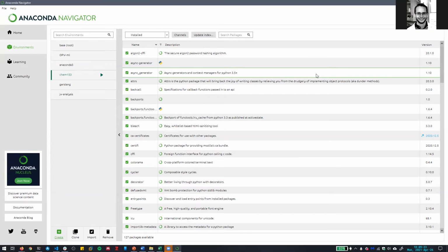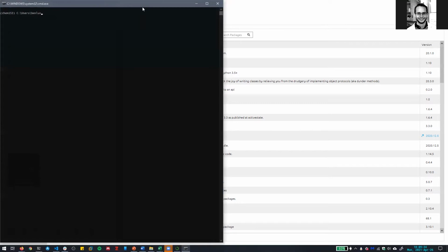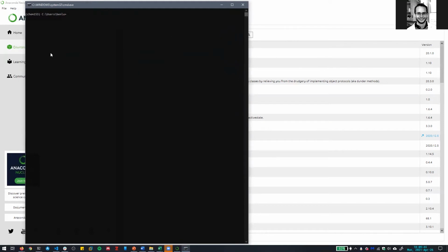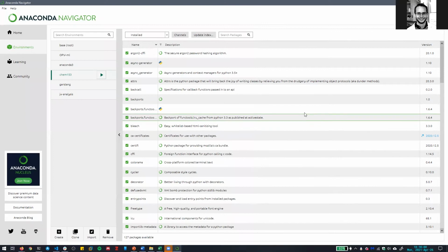So once you actually get the hang of working with programs like this, it's easier to use things from the command line. So I can show you real quick. Open a terminal. On Windows, this is the equivalent of the terminal program on Mac. It's the CMD exe program, which is actually hot garbage. But you're able to do things in this window, like install packages and stuff, which instead of clicking them on this graphical interface, it's actually a lot faster to do it from here. So once we get to the actual lecture on like Wednesday, I can go through some of that stuff with you guys. But yeah, graphical interfaces are convenient.